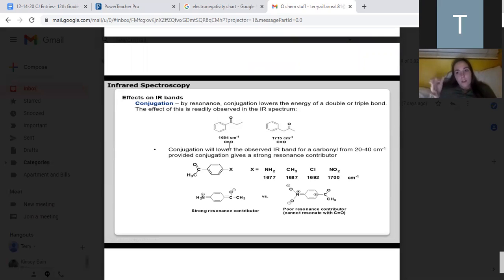Yes. Like, I said, it's not this, so it's not that. And then there's this, but it's not that. And like I said, a lot of times you're not going to get stuck trying to figure out exactly what it is. You just want to pull out a simple, it could be this, and then you'll move on to the other spectroscopies and get more and more information from them. If that makes sense. You got it.